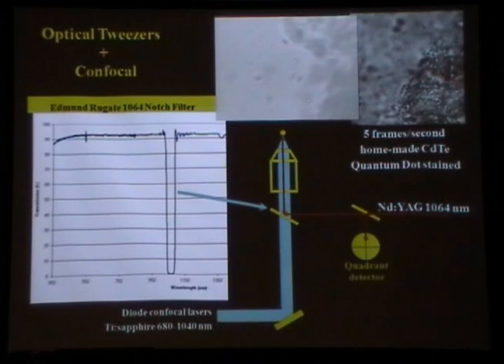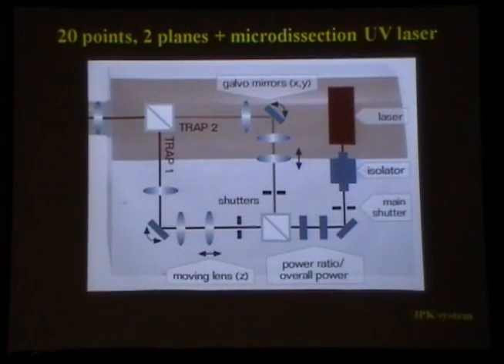So with this, you can combine with the optical tweezers. In my case, I promised the biologist to buy a commercial system. It's not like the one that Ivan was showing here. The idea is just to split the light in two arms. You have two telescopes here, so you can control the height with these two telescopes, but you also have a very fast scanning mirror.